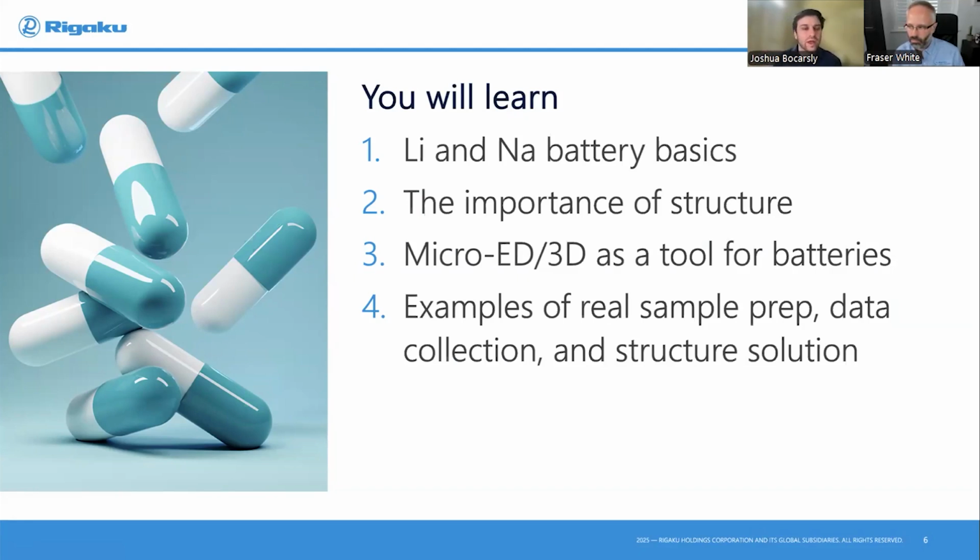Here's a quick outline of the webinar today. I'll start with a background of some of the basics about lithium and sodium batteries, highlight the importance of structure and crystal structure in this field. We'll talk about micro-ED or 3D electron diffraction as a tool for batteries, and then go through 2 real examples of batteries with different sample prep, data collection, and structure solution.